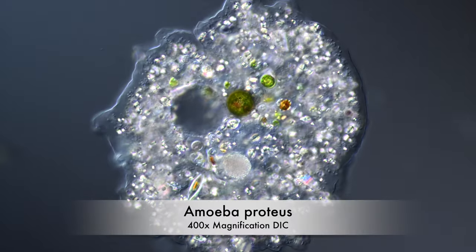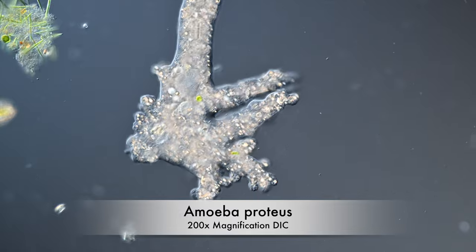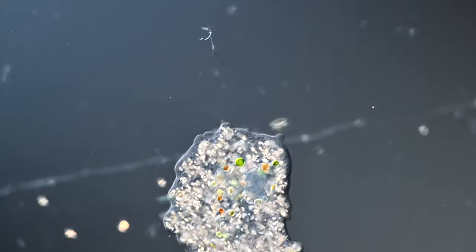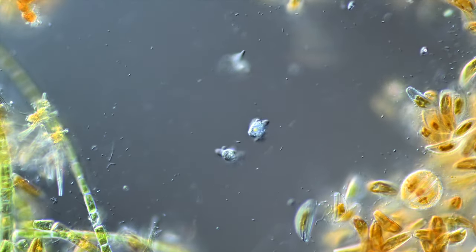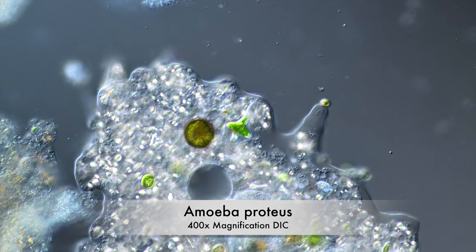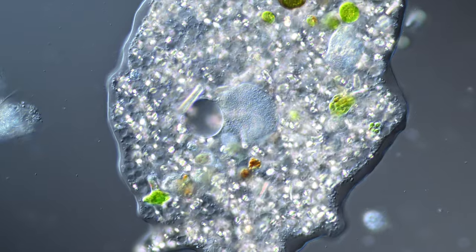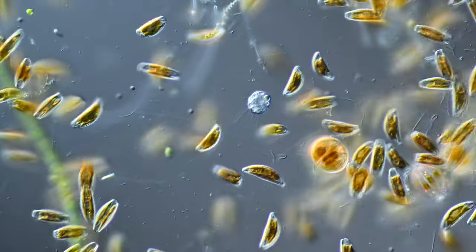Today I want to show you how you can grow your own amoebas at home. Amoebas are fascinating unicellular organisms that behave like a liquid. They flow. Their cells can take any shape and feed by flowing around prey like an avalanche. Look, this one swallowed a euglena that is still swimming inside of the amoeba cell. Amoebas are little monstrosities that easily beat every single sci-fi alien out there.